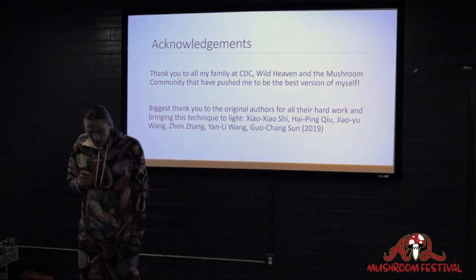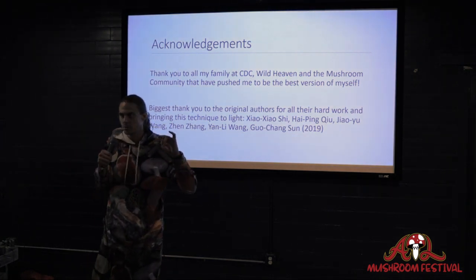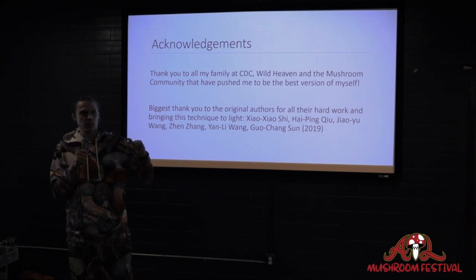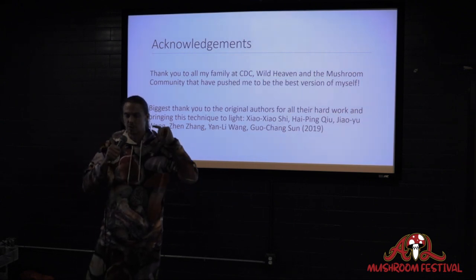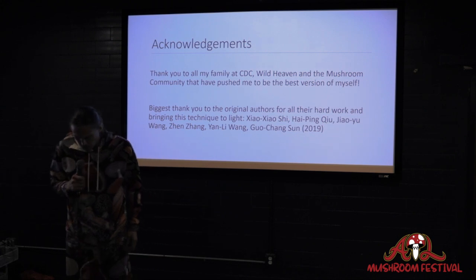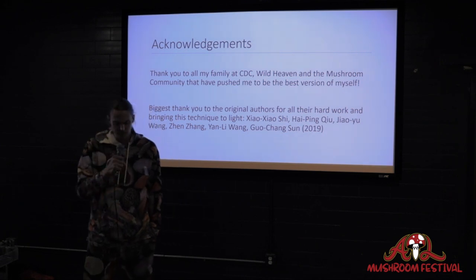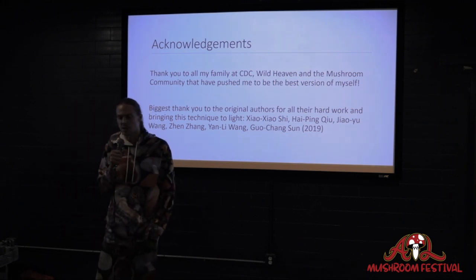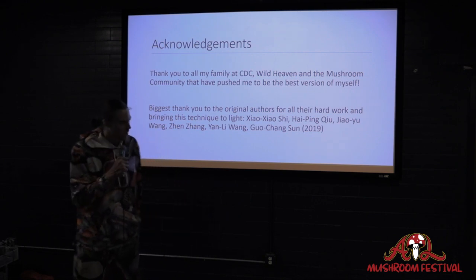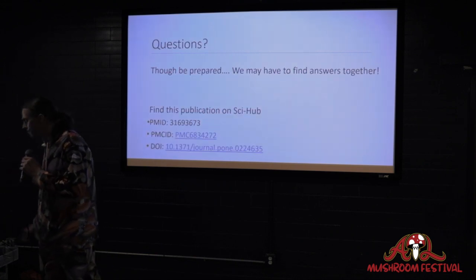I do recommend, though, that if you are going to store them in the fridge, I would make your agar plates 25 milliliters as opposed to 20 milliliters or less, because the 25 mil plates tend to last longer in the fridge. You will get a solid 6 months out of it and potentially up to a full year before that plate dries out and disintegrates. So something I learned while I was at CDC, and it's something I've carried with me ever since. And it doesn't sound like that 5 milliliters makes a difference, but it sure does. So you really do get some extra time out of it. And plus, when you're breaking it down and putting it in your bags, it's just a little bit of extra nutrition, a little bit of extra culture. It tends to just work a little bit better for me. So that's the reason why I do that.